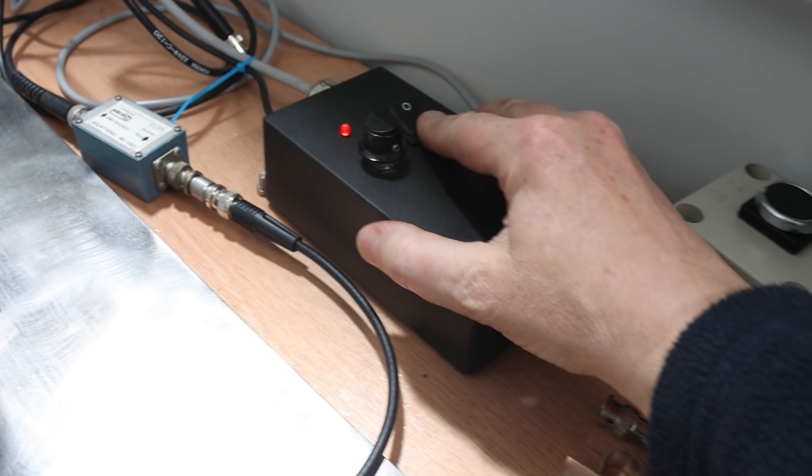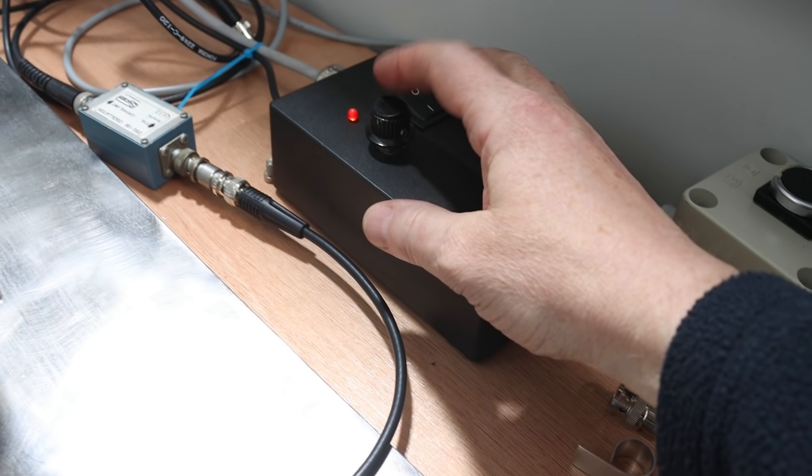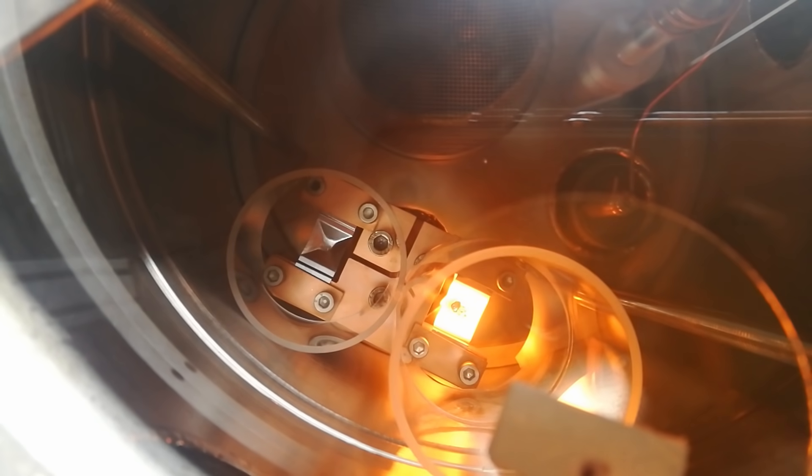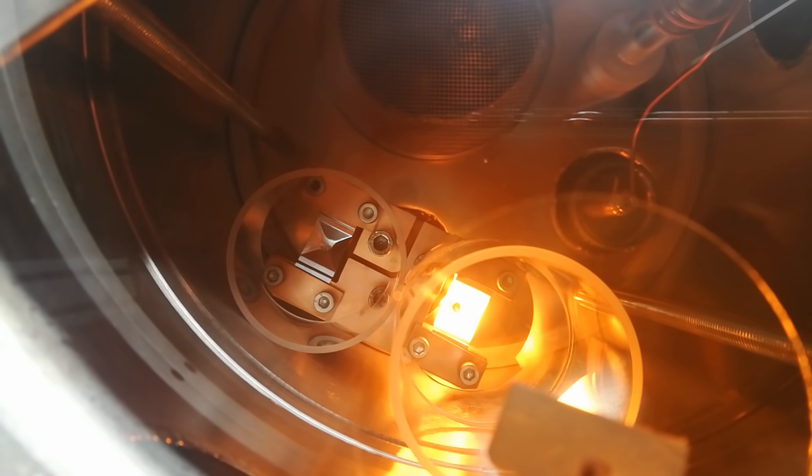After the pump down and the plasma clean, I can run a current through the tantalum evaporation boat that contains a few small grains of silver. Here you see a top view of the evaporation boat through a glass substrate.